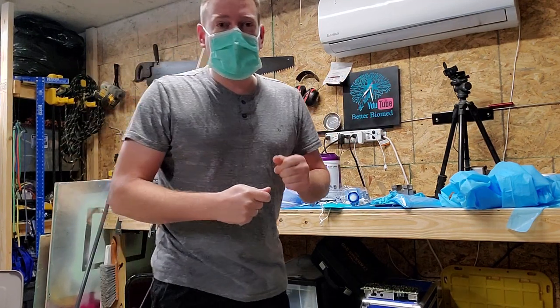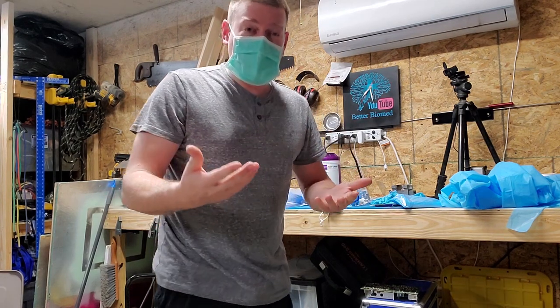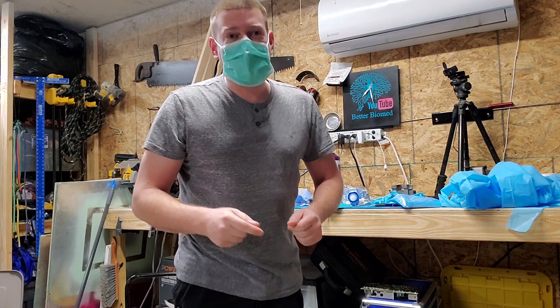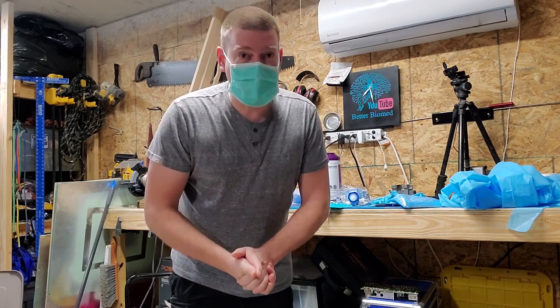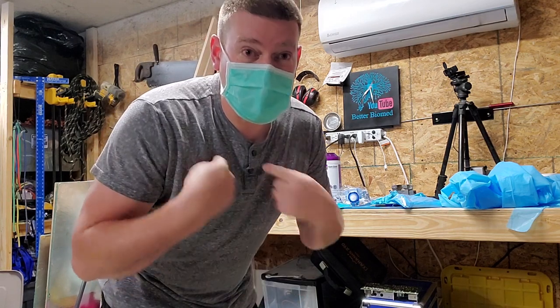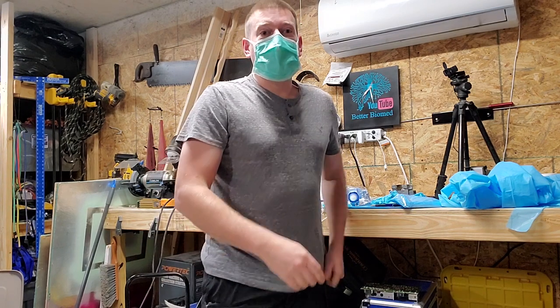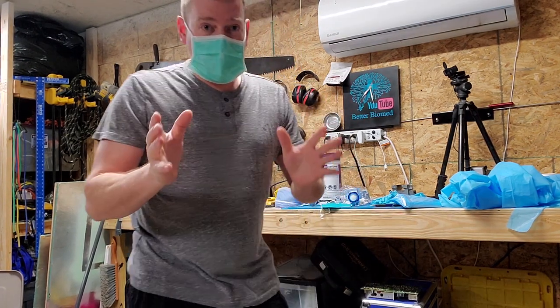Today, I'm going to show you guys the proper way to don and doff PPE. And this is especially important because I'm seeing a lot of you biomeds out there not doing this correctly, and you're possibly contaminating other people, including you, me, anybody else, other patients, who knows? So here's the proper way to do this.